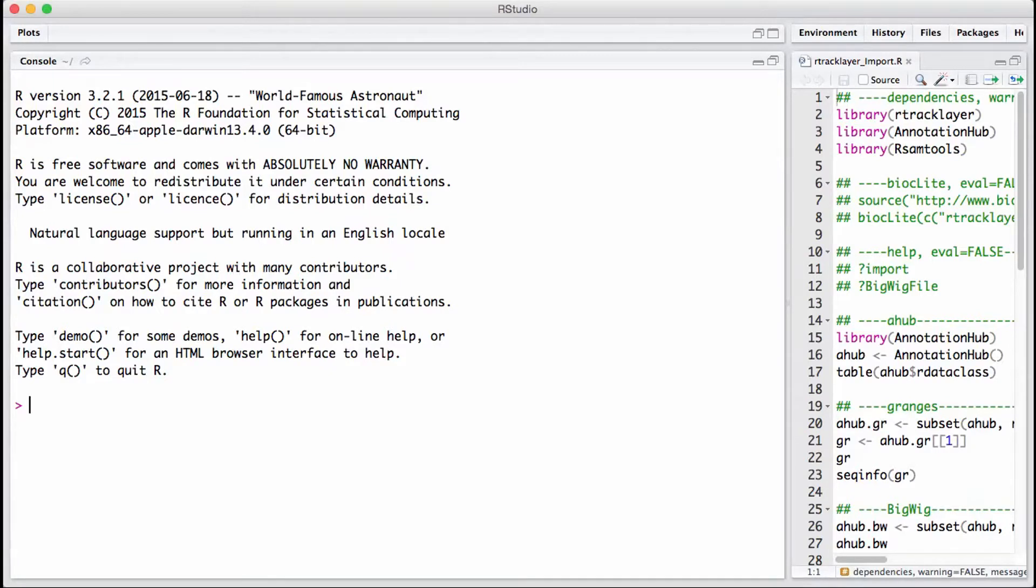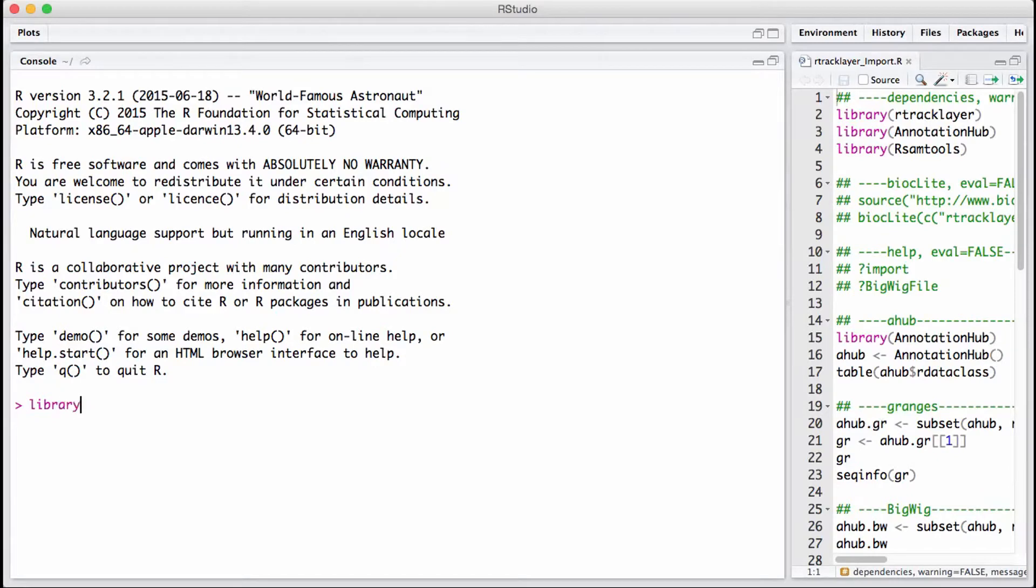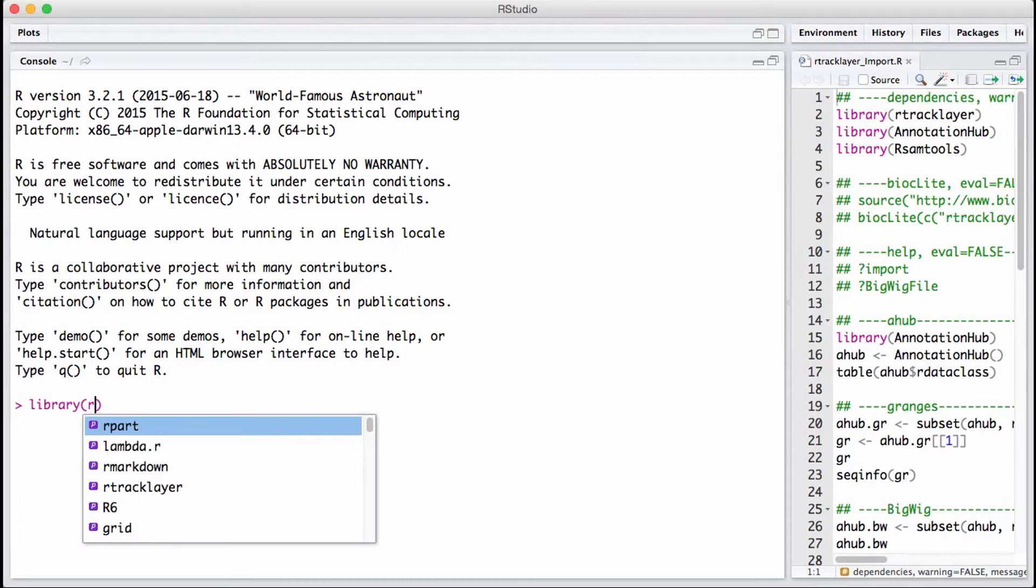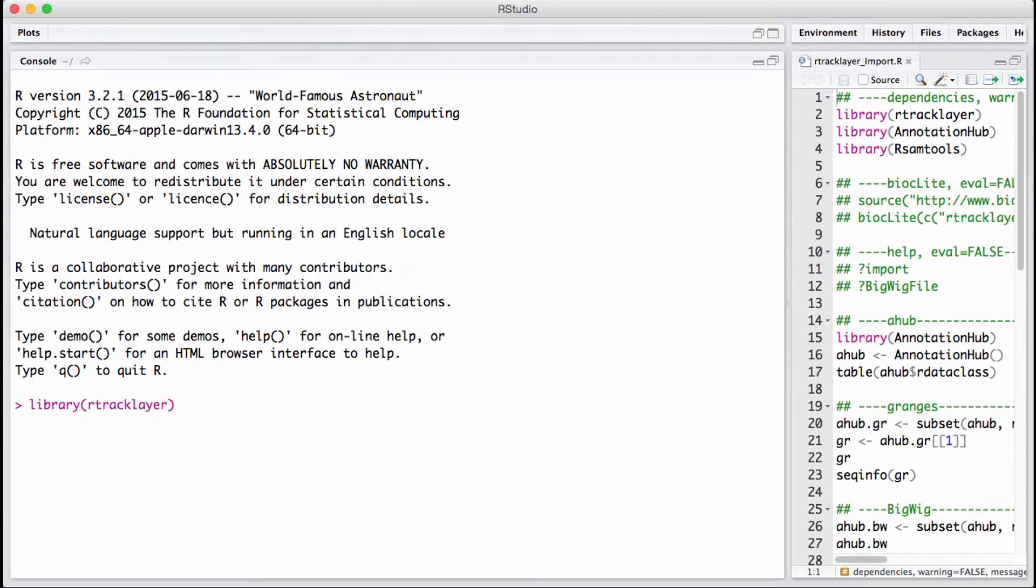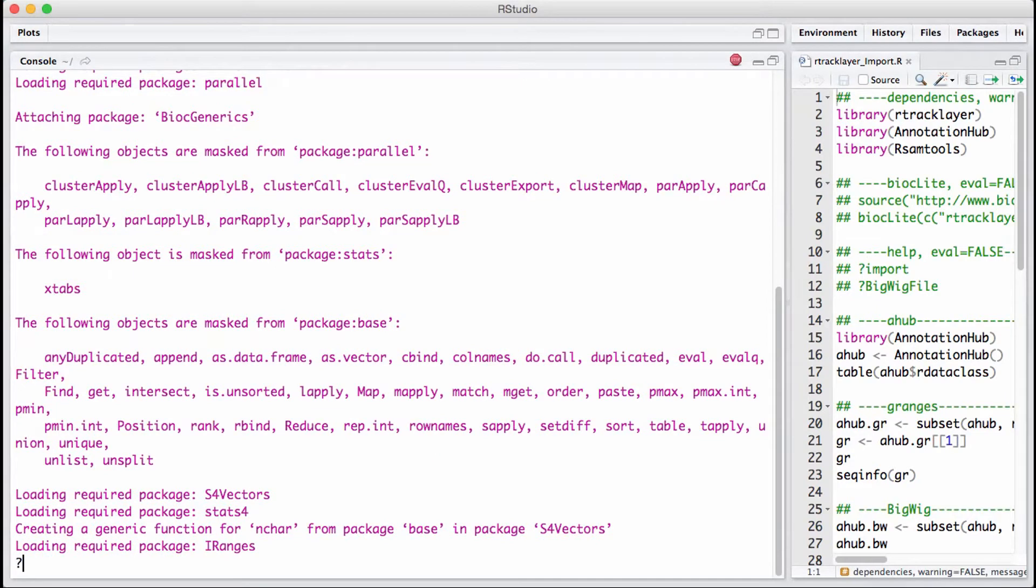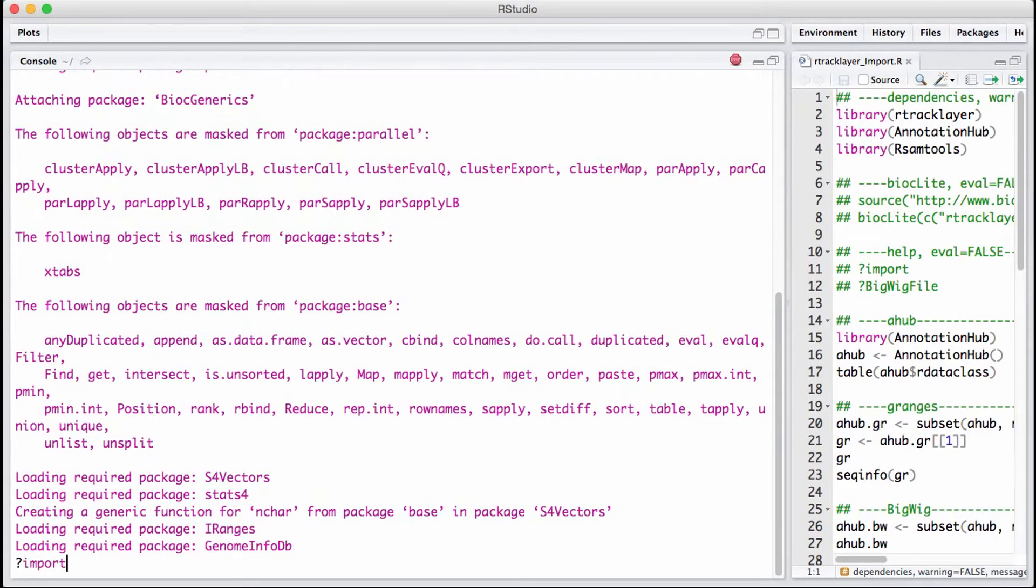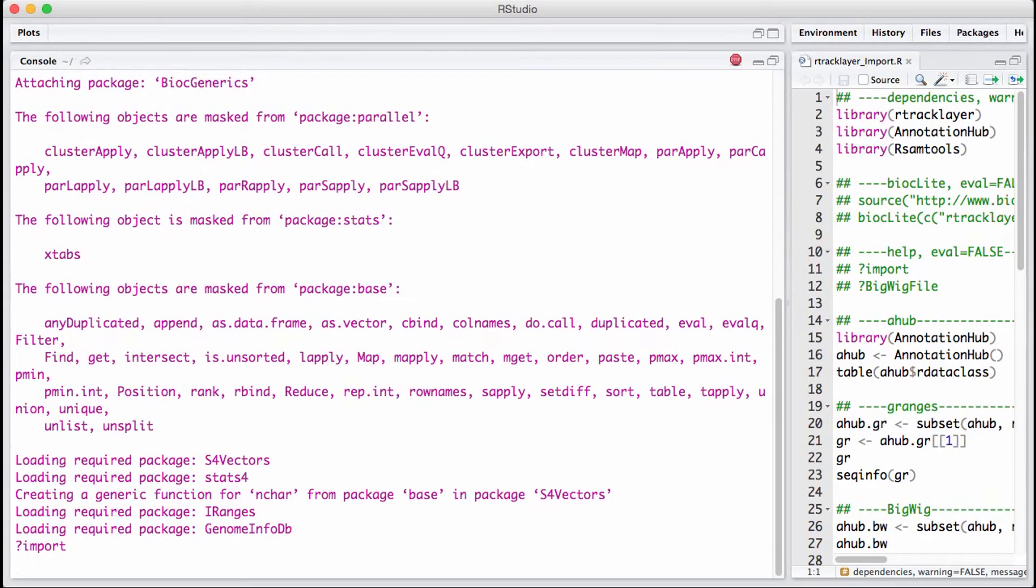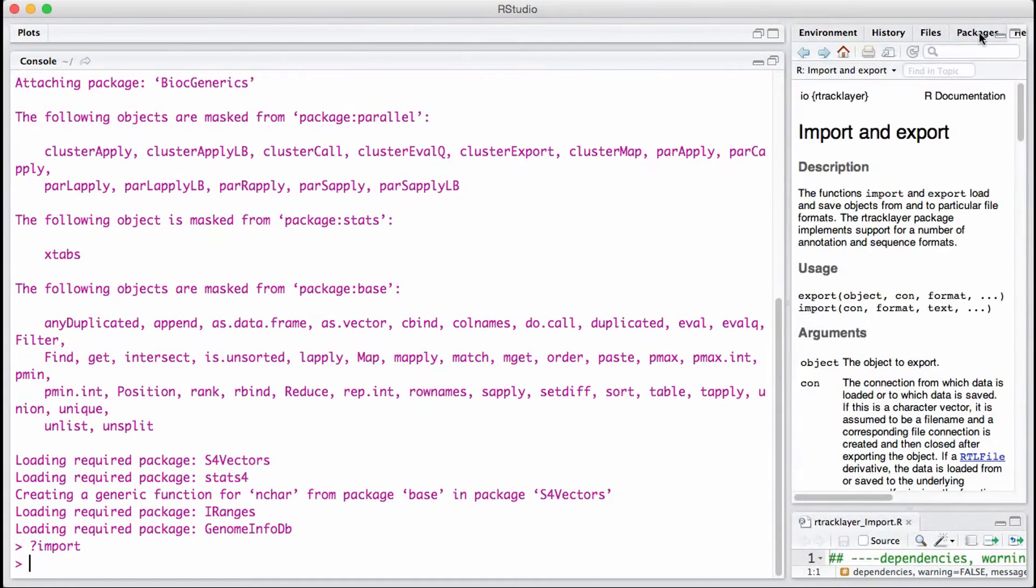Let's begin by loading the rtracklayer package. Right away, we can look at the help documentation for how to use the import function based on the R data.